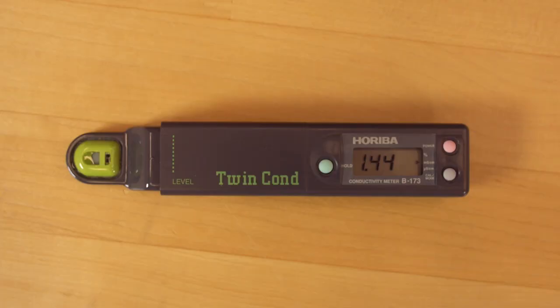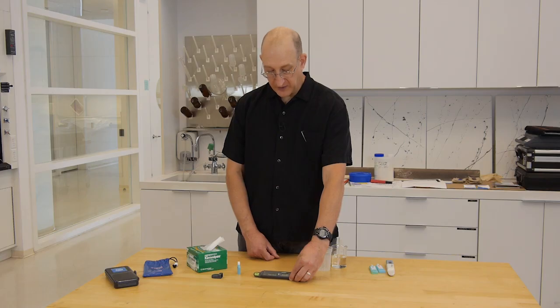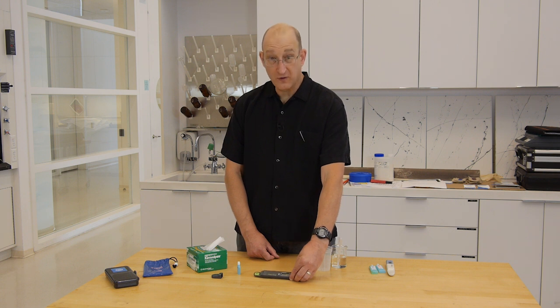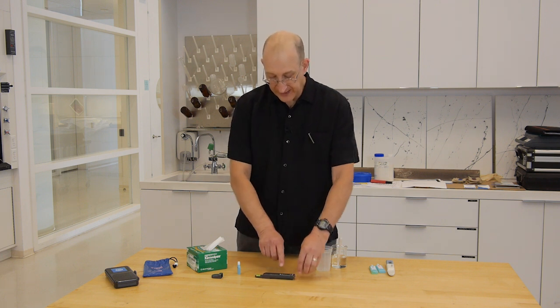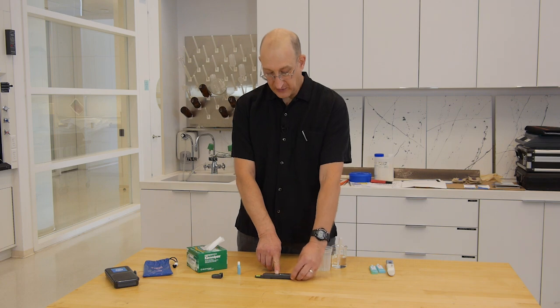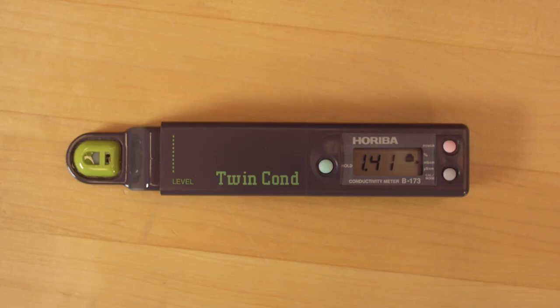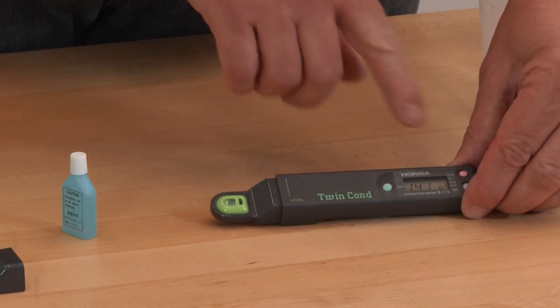Wait for the reading to stabilize, which is indicated with a small happy face, which we now have. You can see right now we're reading at 1.44 millisiemens, or 1,440 microsiemens. We push the calibrate button and go into calibration mode. You can see the little symbol there for calibration mode. It's calibrated to 1.41 millisiemens, and when we get a happy face, we're all done. So we have our happy face.